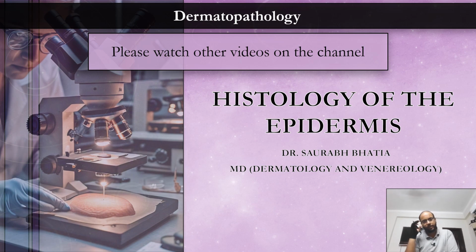delve more into dermatopathology. But I thought that it would be a good idea to discuss dermatopathology, and what better way to discuss it than first to know the normal histology of the epidermis. If you know how the epidermis looks under a microscope, you will easily be able to find out what is wrong with the epidermis when you're analyzing slides from different disorders. And you'll be easily able to find out how a cell is deviating from its normal maturation.